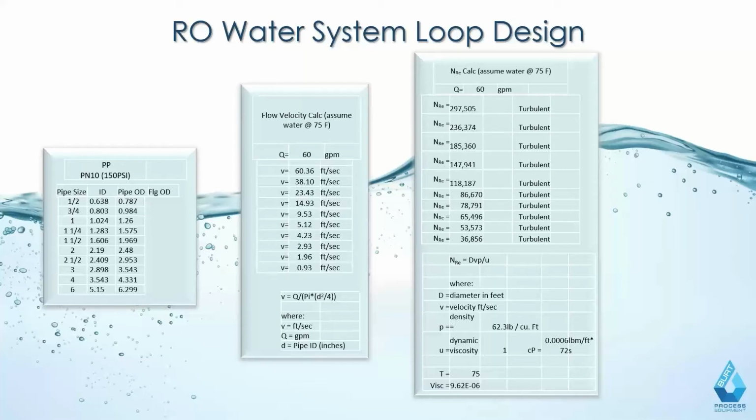And what ozone does is it basically is bubbled into your storage tank. You shut off your UV lights, you disconnect any DI bottles in those cases, and you allow the sanitant to run through the system, typically overnight. And the nice thing about ozone is it's a gas, so when it actually reacts, it turns to oxygen and then basically bubbles out of your system. So there's no residual there for removal. If you use things like peroxide base, you typically need to flush it out of your system, which causes a fair amount of drainage and then also further waste treatment when you have to drain those out.